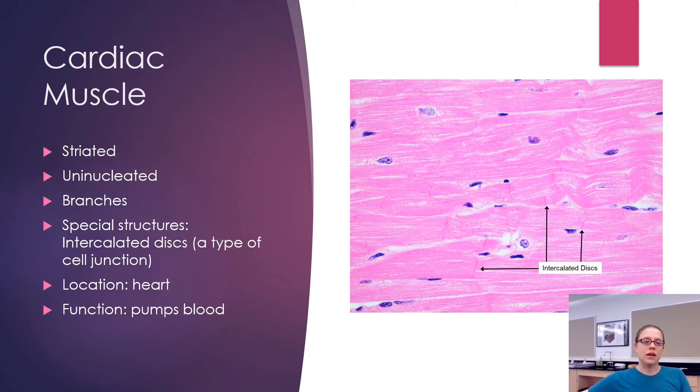Next we have cardiac muscle, which like skeletal muscle, is also striated. It also has the light and dark lines in it, although they're a little bit fainter here. One difference you'll see right off the bat is instead of having many nuclei, there are a lot less because cardiac cells are uninucleate.